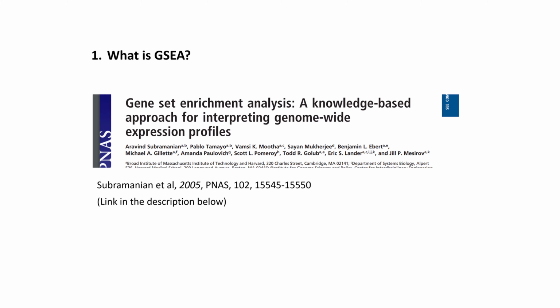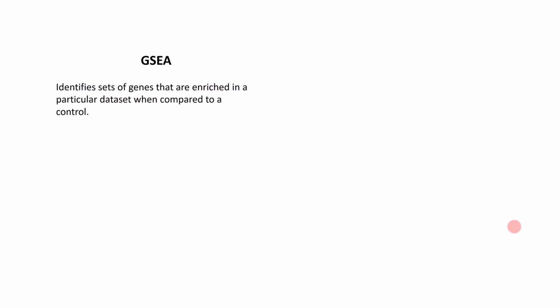GSEA is a knowledge-based approach for interpreting genome-wide expression profiles. You can use it to interpret changes in gene expression from, say, an RNA-seq experiment or a microarray experiment. It was developed by scientists at the Broad Institute, and the main reference is a paper here from 2005. So what does GSEA do?